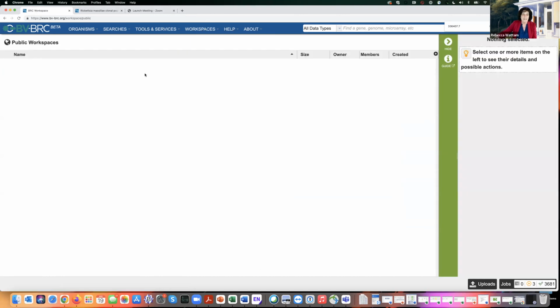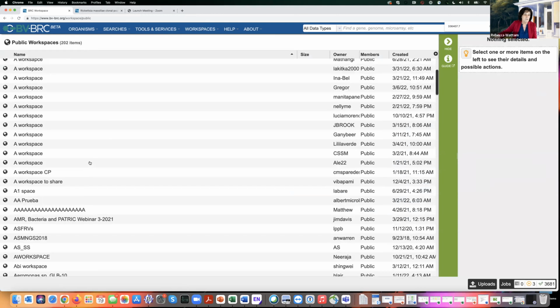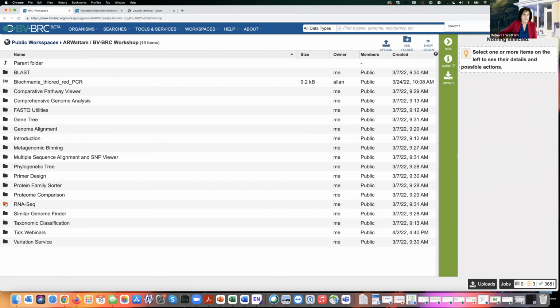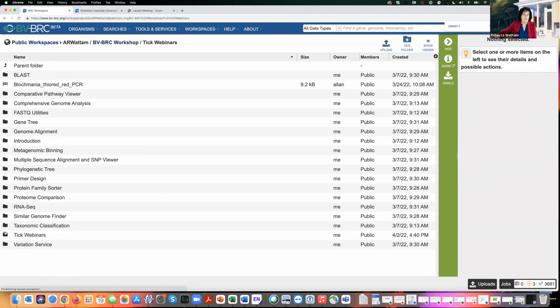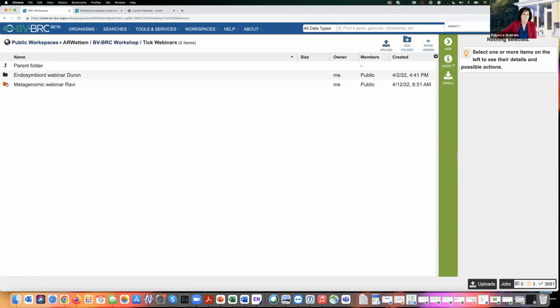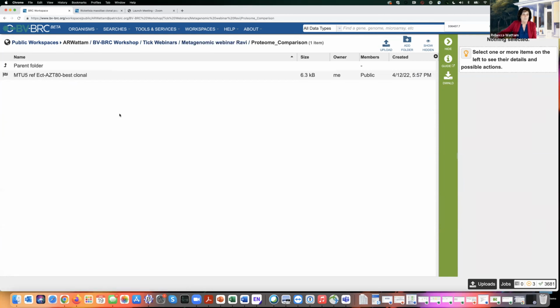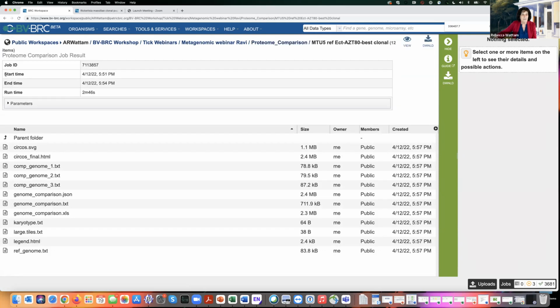baked my cake, and it's all here in the public workspace. And go down to BVBRC workshop, tick webinar, metagenomic webinar, proteome comparison. And here's the single job that I ran. Clicking on that, and once again, refer to the tutorial for all of these things.